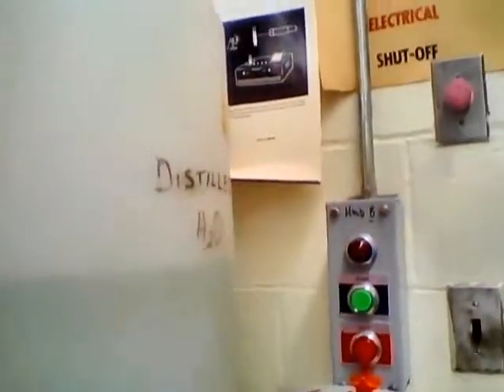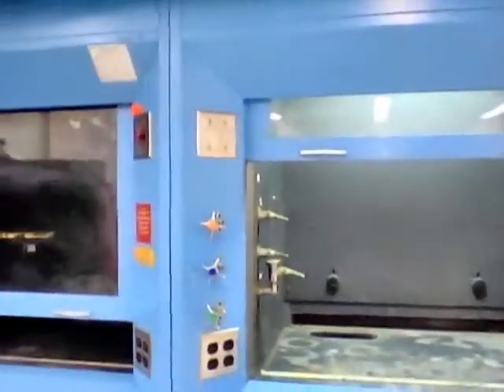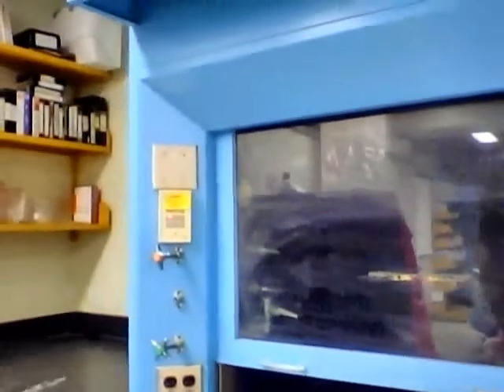We also have the on-off switch for one of the hoods over here, and that is for this closest hood. These big blue structures here are where you can find the hoods, which suck out any gases and vapors we don't want. I'll tell you when and if we need to work inside there, and there are lights in there if you have to do some work. The other hood, right next to the first one, has its on-off switch if you follow around the corner, behind my bookshelf, on the wall. Alright, what else do we have over here?